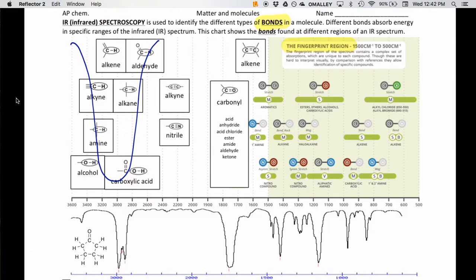Infrared spectroscopy gives things where the peaks are upside down, and they're still called peaks, just like you see down here in the example we'll get to in a second. The peaks are these troughs that dip down from the top. So an OH stretch, it's called, would look like this, with a very broad, deep peak as a result.